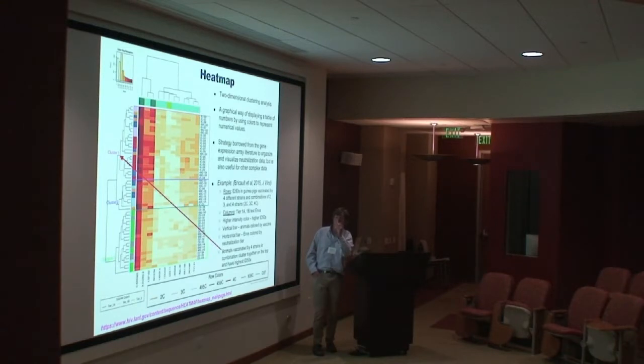But the point is, by the clustering that's done in the package to make the heat map, generally speaking, this lower cluster, these guys all behave similarly and have fairly poor neutralization. This group, you see the tree here, have moderate neutralization, and this group all has pretty high performance. And you can see here that most of the animals in here are in the red group, whereas it turns out they had four variants of the vaccine, and most, or in fact all, of the red group are in this higher performing group.